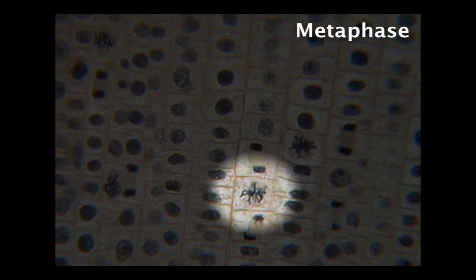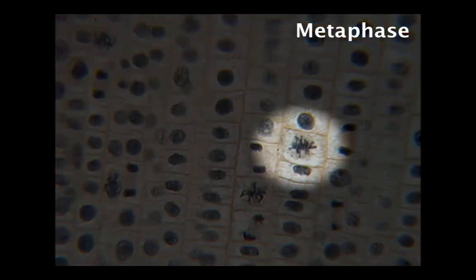Slightly below and to the right of the center, we can see two cells that are in metaphase.